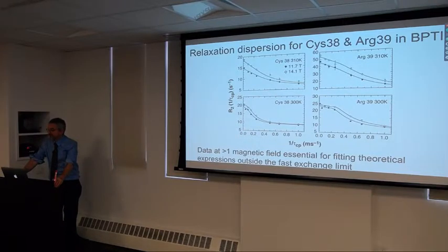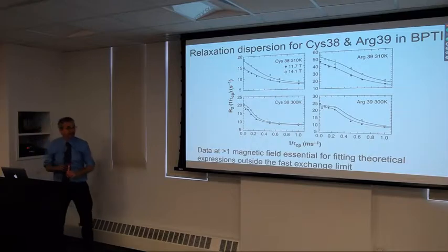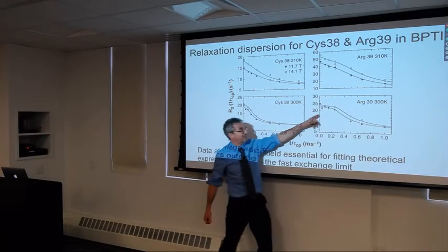Well, anything between, I mean, there is 1 millisecond tau CP, so one can probably get out, as I said, 0.5 milliseconds would get you out to 2. So out to 2 is pretty simple. And so the higher the better, but not too high, basically, as long as you don't get too high a duty cycle. Right, so the shorter tau CP, the better you define the plateau. The longer tau CP, the better you define where these kinks happen.